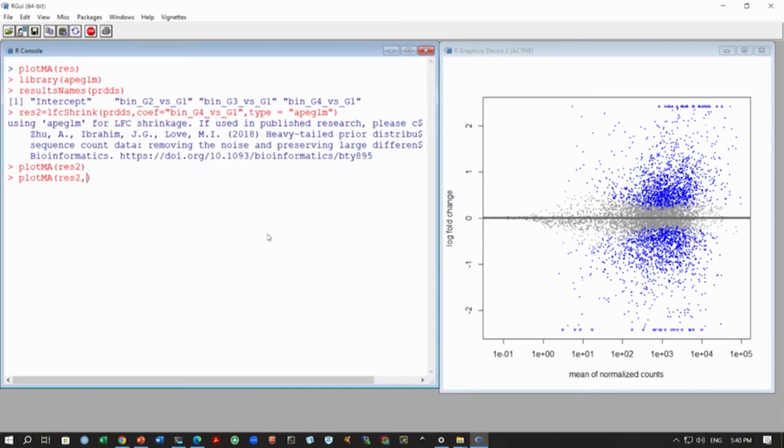So what I'll do is start with this. xlim, ylim is fine. So we can change the cex.lab to 1.4 and cex.axis to 1.2. So we are changing the sizes of the labels, because I think they are too small.